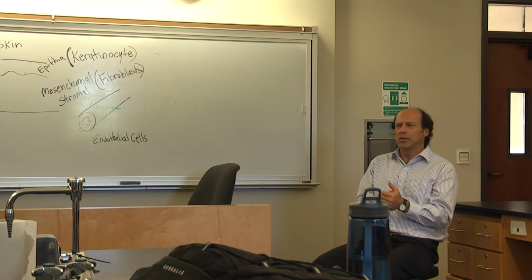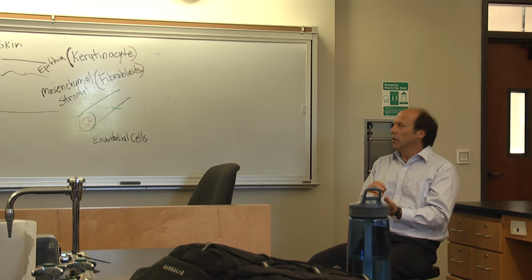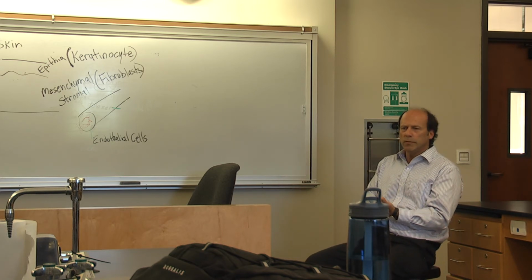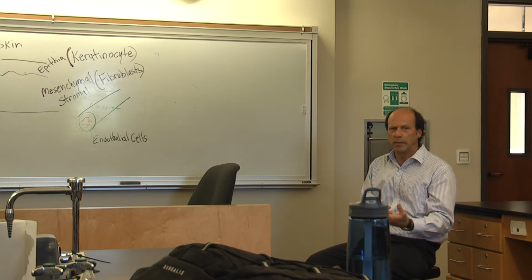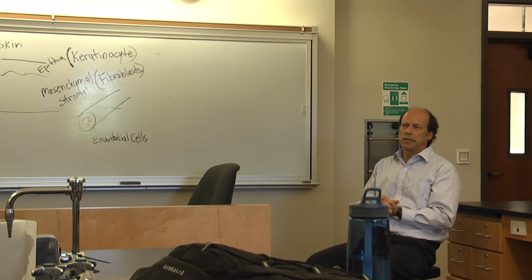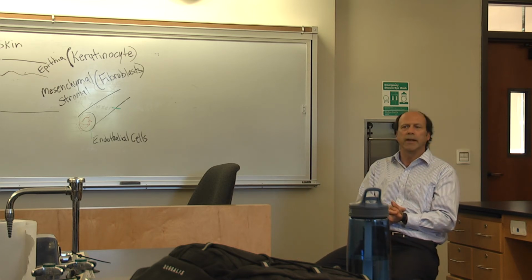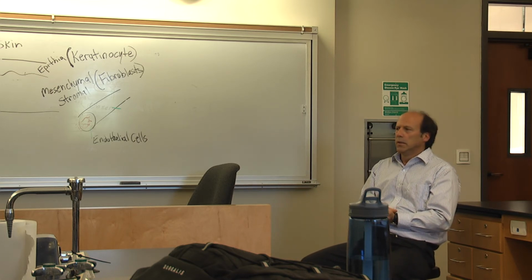I'm not going to tell you absolutely that you can't work in my lab without a lab coat on, because to be honest, there are always a lot of people who are not in lab coats. We've got a couple of them in the lab now. Don't leave with any of our lab coats, but you're always welcome to grab one if it's sitting there and you feel you need one. But considering that it's generally useful in labs, it's probably a worthwhile thing to have. Just get one.